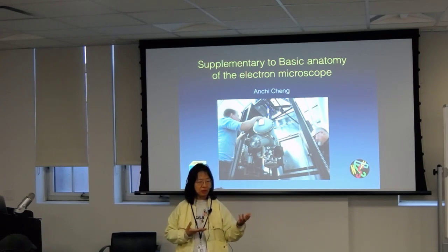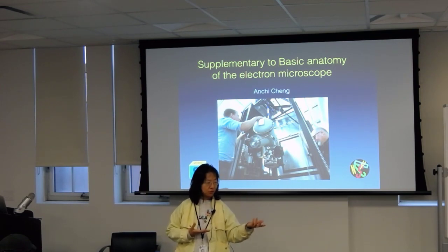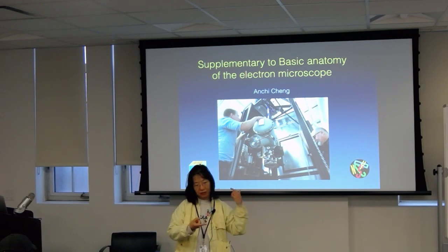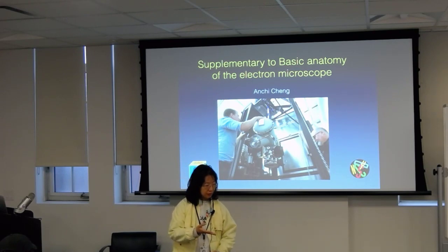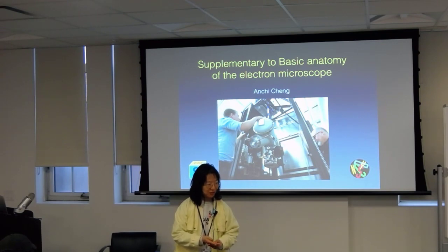Did you find out, for example, what kind of electron source it is using? Is it a tungsten, a LaB6, a warm FEG, a cold FEG? So no idea. So you didn't find out anything more than just what the make is.